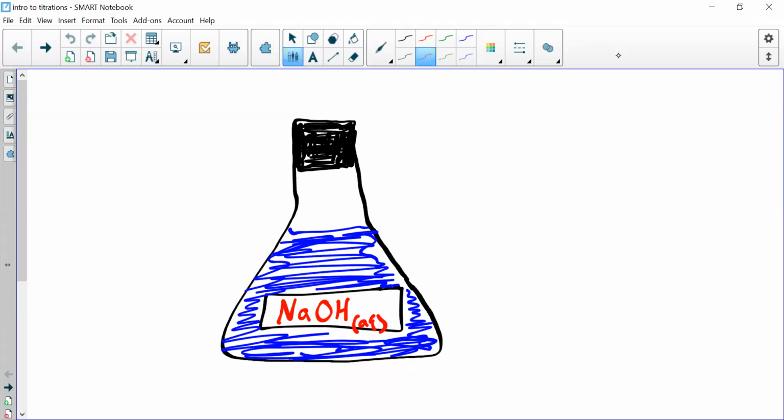Hi everyone. In this video I'm going to talk about titrations. That's the whole focus of this week. So what is a titration? Well, a titration is a lab technique to identify the molarity of an acid or a base.